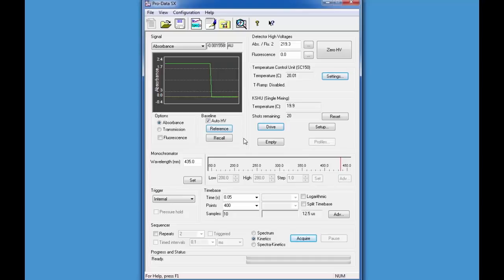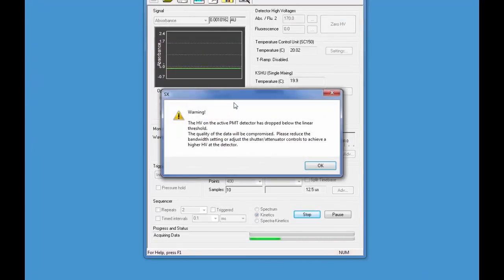If the high voltage is less than 200 volts, there is too much light and the slit setting should be decreased to reduce the light intensity to within the usable range. Nevertheless, a warning message will let you know if this is the case.